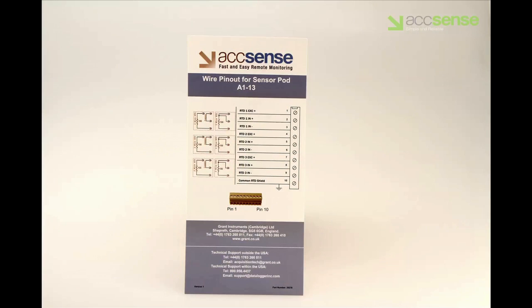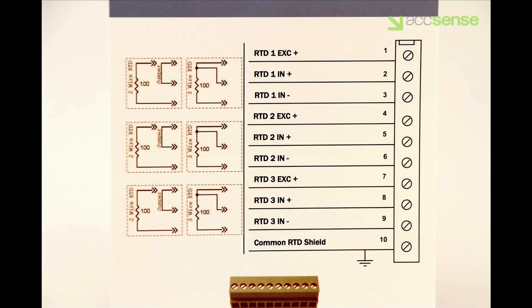Here is the pinout diagram that comes with the pod. It describes how to hook up the probes to the pod. The close-up view shows the terminal block, the numbering of the pins, and the location of the wires to be connected.